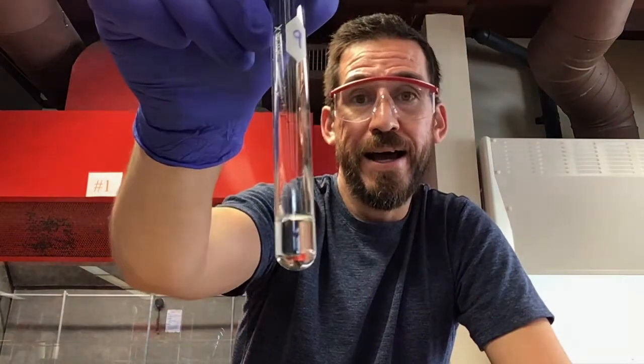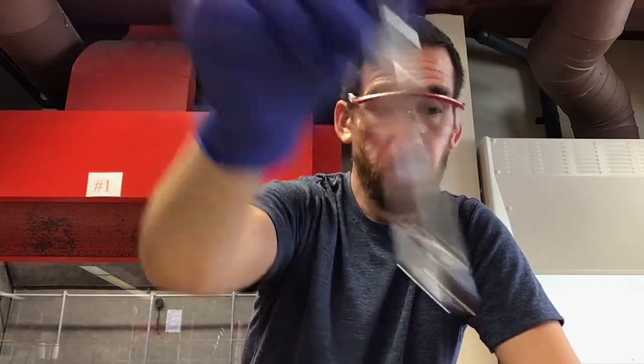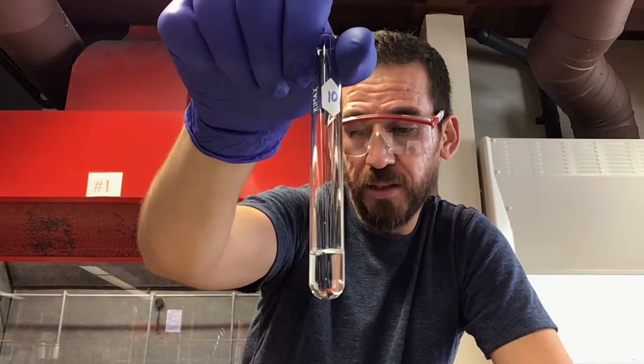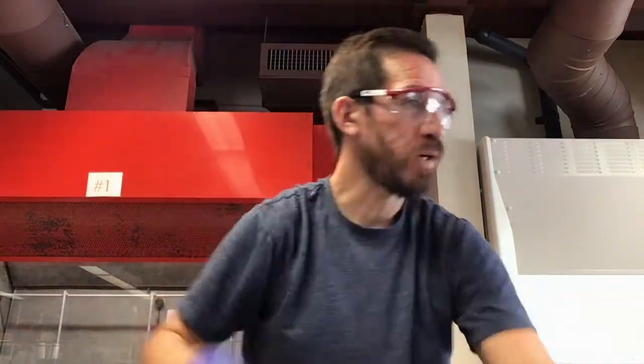Not a thing. Number 9, same. Nothing going on. Number 10. So number 9 and 10 were bromocyclohexane and bromocyclopentane, respectively. Not a thing. Okay, so what we've got here is failure to react.